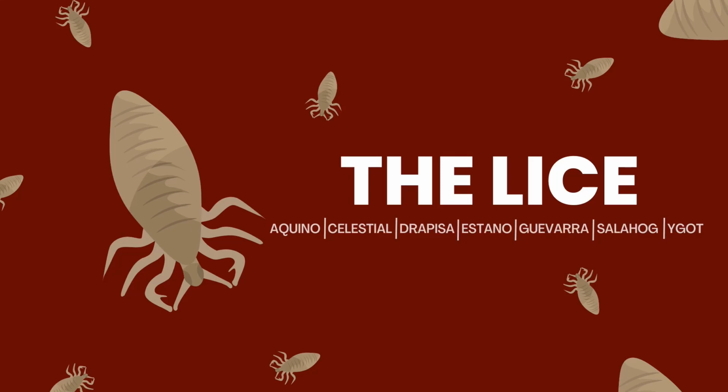What a great day to talk about parasitology! I am Clyde. And I am Alvin, and we'll talk about 3 different species of lice.